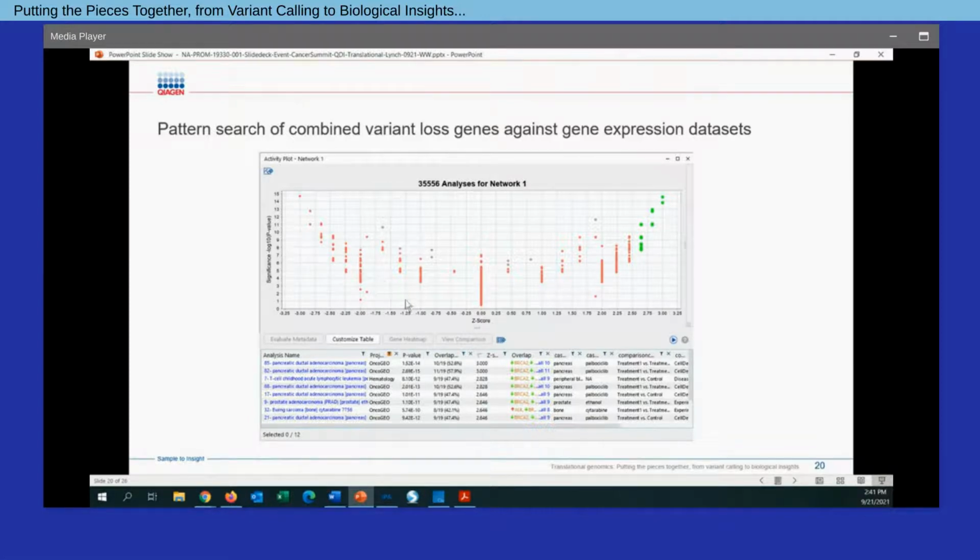Within this plot, very simply, we have what we call the z-score on the x-axis, and that's our metric for similarity and dissimilarity. Values above 2 typically represent where the gene sets overlap between our variant data and these expression studies, meaning the pattern of expression of the genes recapitulates the loss of function in our gene set that we observe from the Lynch syndrome study.